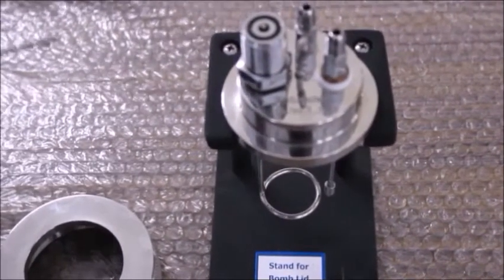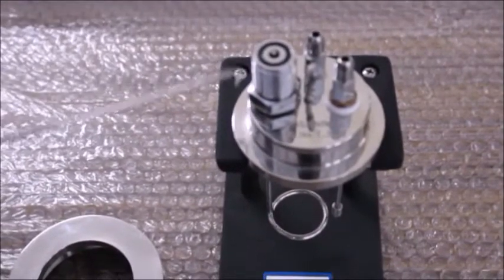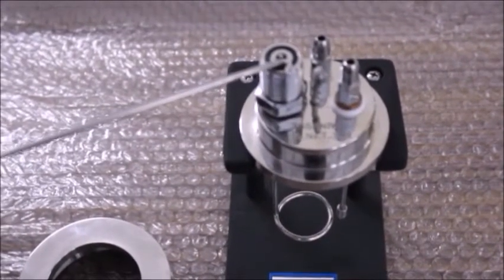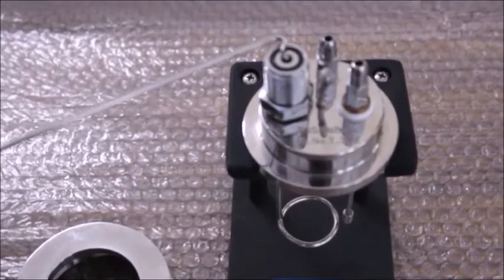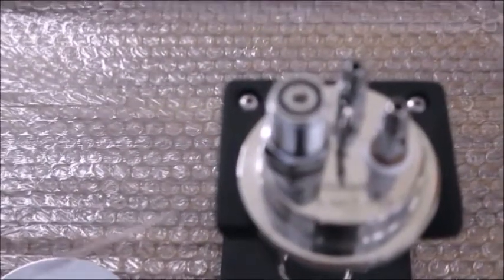The bomb lid consists of the non-return valve, also called the NRV. It is through this valve the bomb body is filled with oxygen.